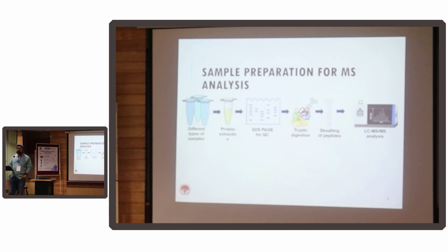And what do we do with trypsin? We break down the proteins. So isn't it very strange that first I'm telling you your protein should not be degraded, and then I'm telling you to degrade your proteins with trypsin? I'm not kidding, but that's what we do. This is for bottom-up proteomics. There is top-down proteomics, which is not part of the syllabus.